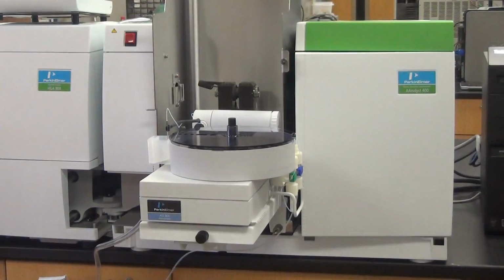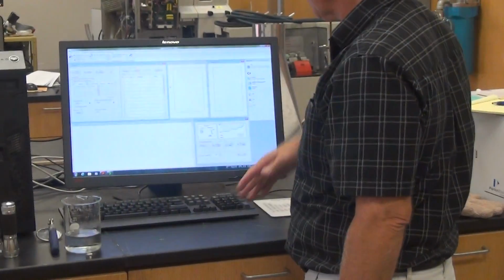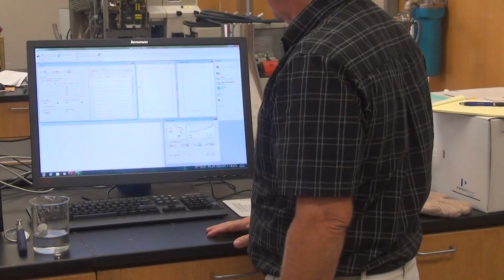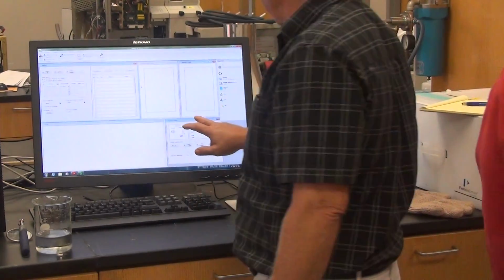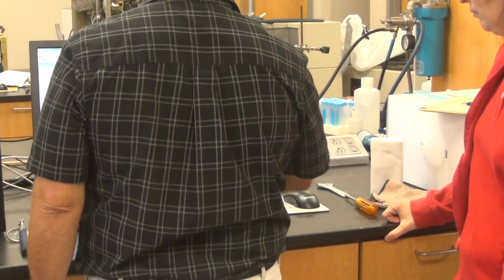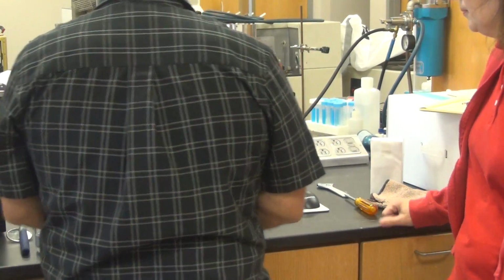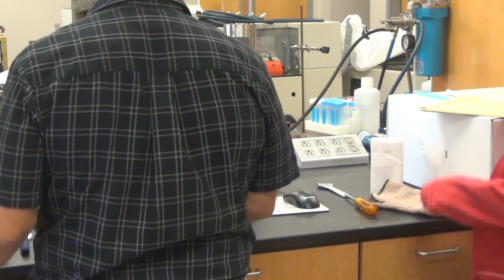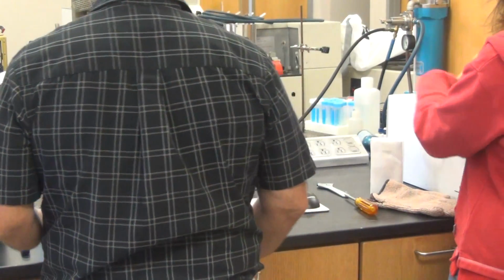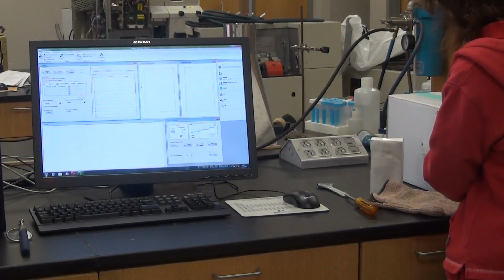So, it has changed techniques. The last method I used was a characteristic mass one. It looks basically the same thing, but now instead of flame control, I have furnace, and this is referred to as a workspace. Okay? So it's real simple. It's the same thing. So let's talk about what it takes to align this furnace.